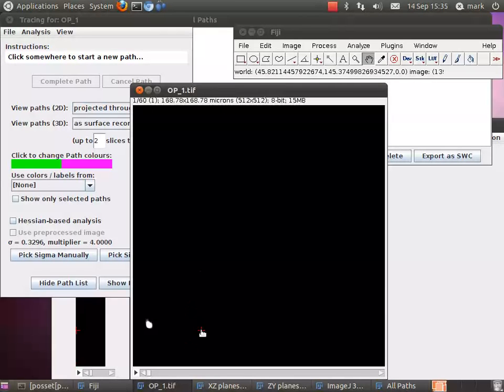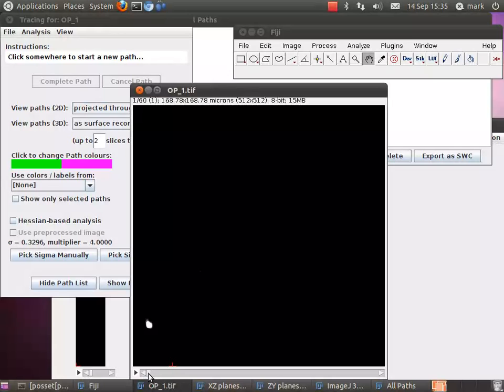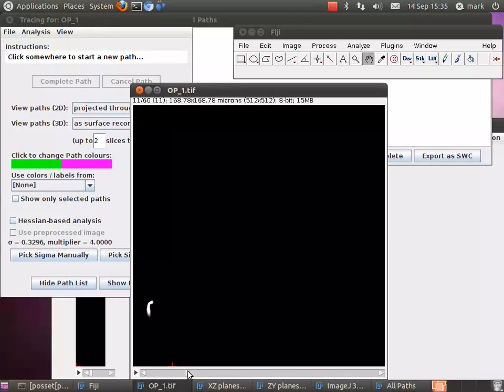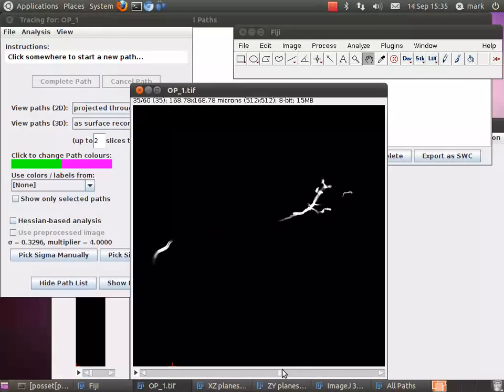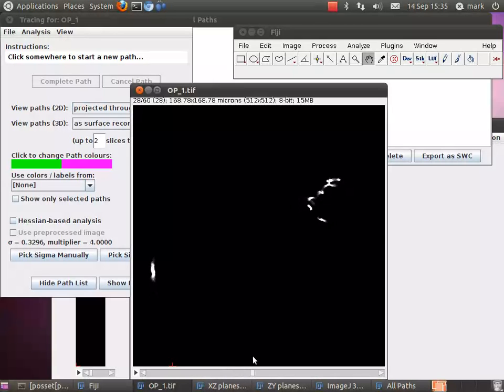This is a screencast to demonstrate a couple of new features of Symphile Neurotracer that might be useful for people tracing images which have relatively sparse but bright and clear processes. I've got an example here which shows, as you can see, very bright neuronal processes, but in each section you can see very little of the neuron at any one time.